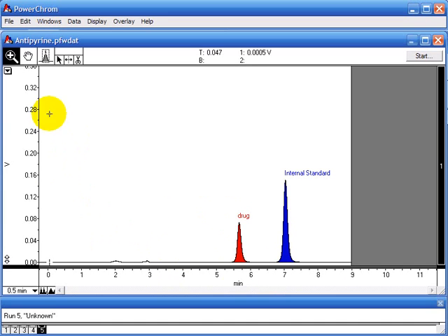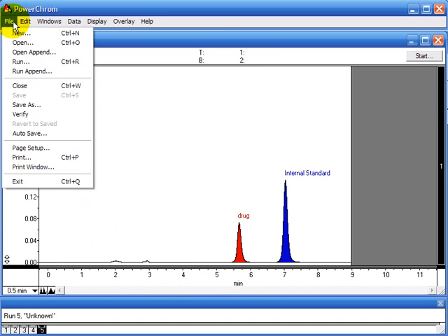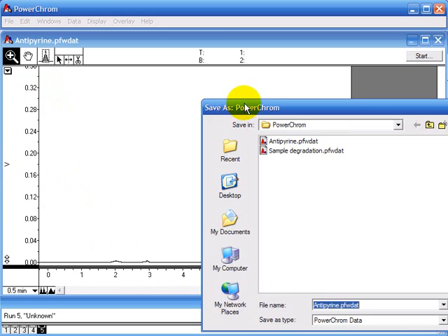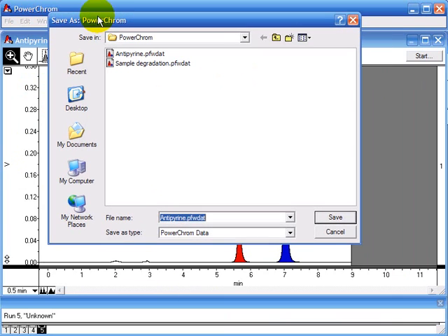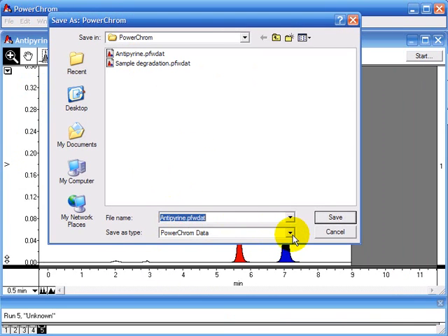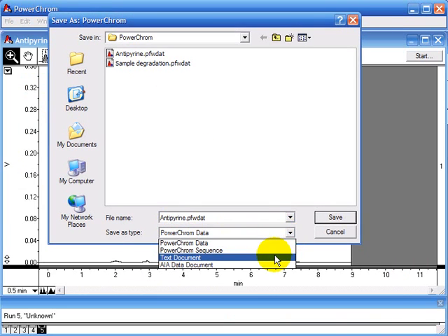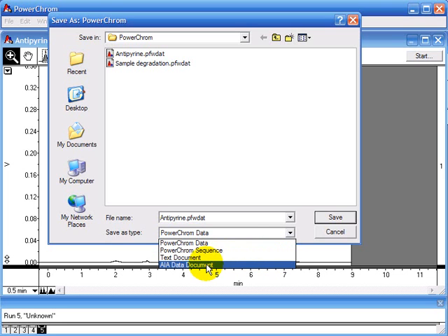Another option is to Save As. If you go to File, Save As, here PowerChrome gives you the option of saving as a text file or as an AIA document.